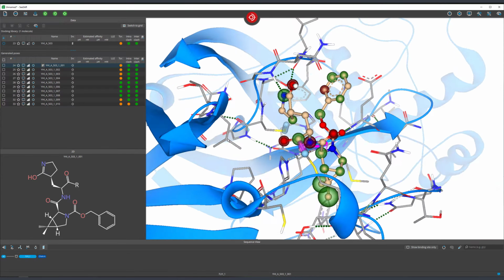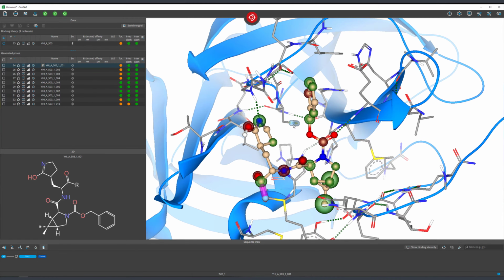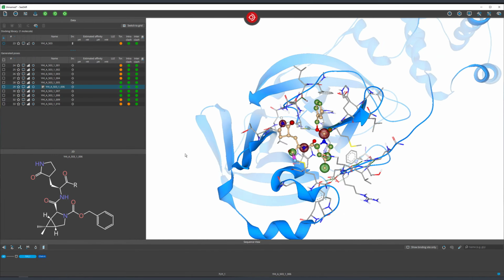There we see it. And the cysteine residue here remains open, it's blue, and it's not marked for covalent docking in this case. And this essentially opens up several possibilities.